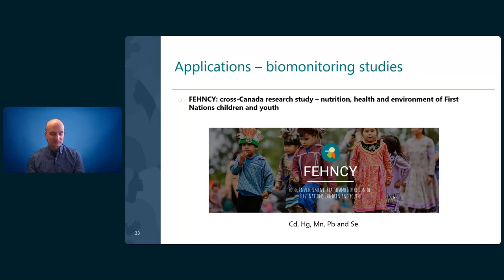For the next phase, they plan to use the VAMS devices for blood collection, and to analyze for cadmium, mercury, manganese, lead, and selenium in our laboratory with the full method we just developed and validated. This is a study about the nutrition, health, and environment of the First Nation children and youth here in Canada.